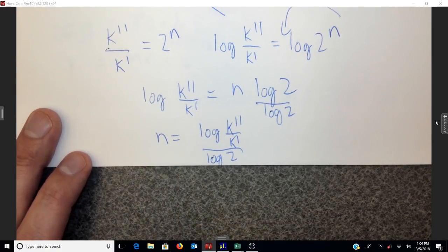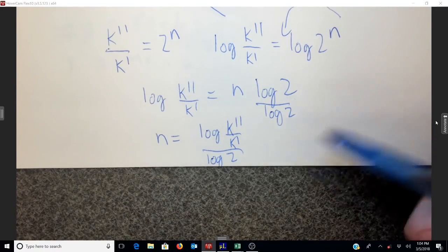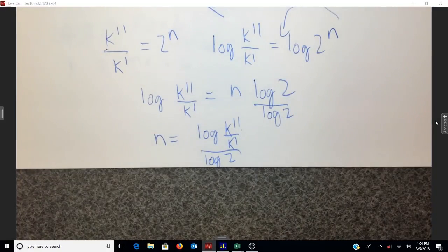What's the most important thing is to realize that we need to run it again with 2 milliliters of bleach, graph it, find the rate constant, and then just plug it into this equation.